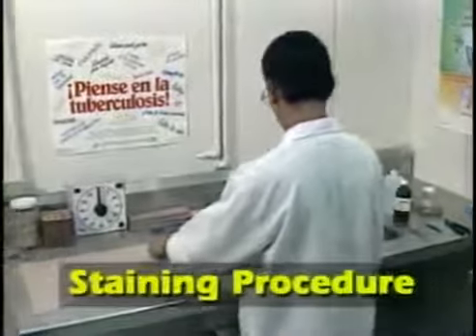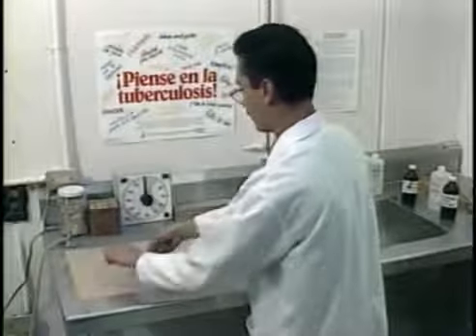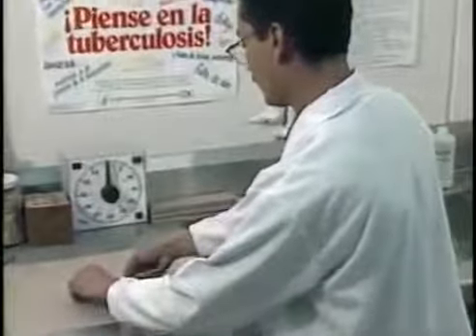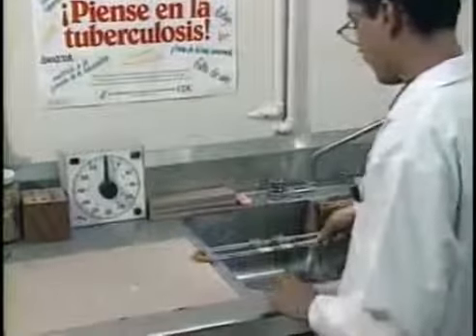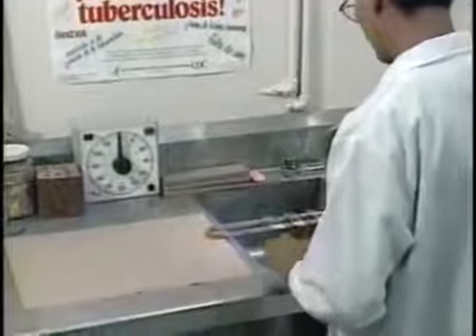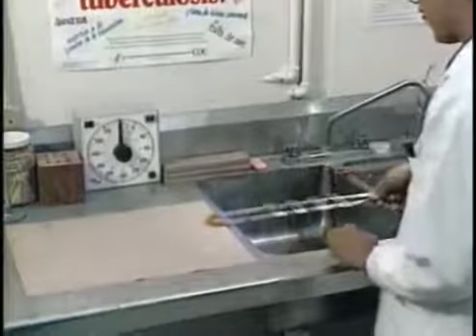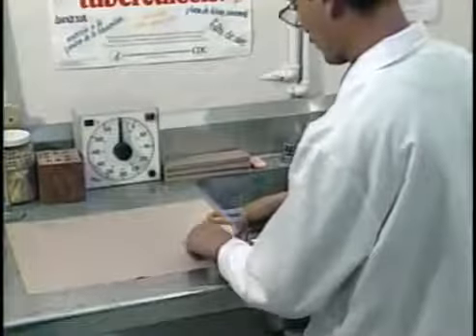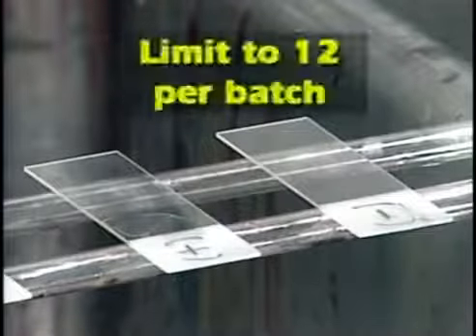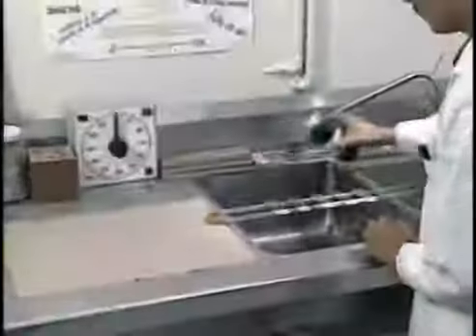Now, let's study the important steps of the staining procedure. Using forceps, place slides on a staining rack with the smear side up. Place all slides in uniform orientation. Slides must not touch each other. This avoids the possibility of stain running over and causing cross-contamination. Include a positive and negative control slide daily for quality control purposes. Never stain more than 12 slides at a time.